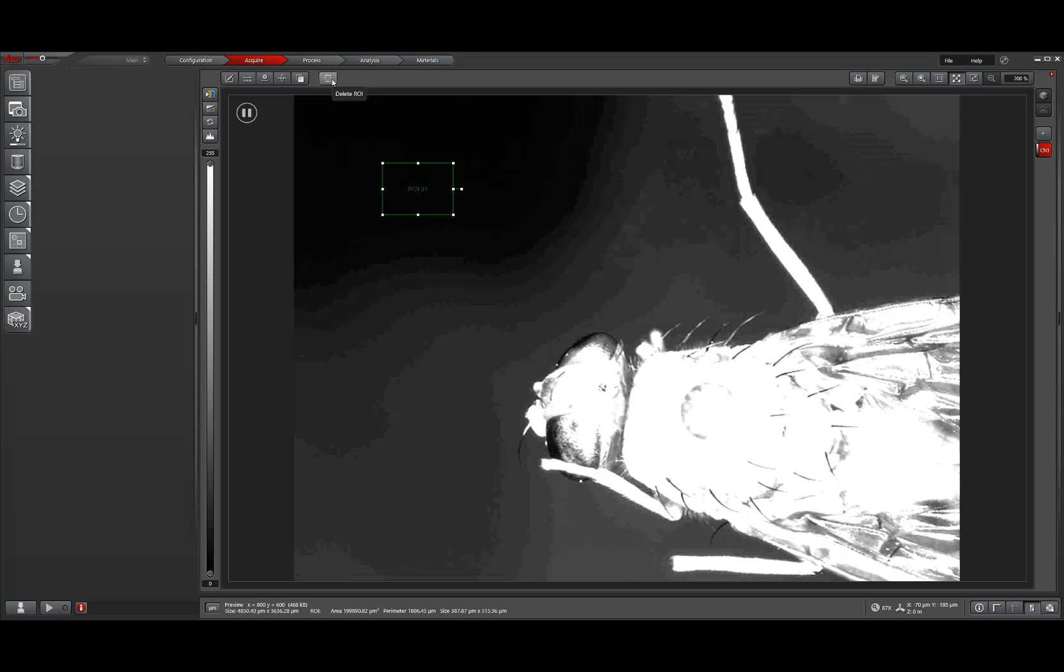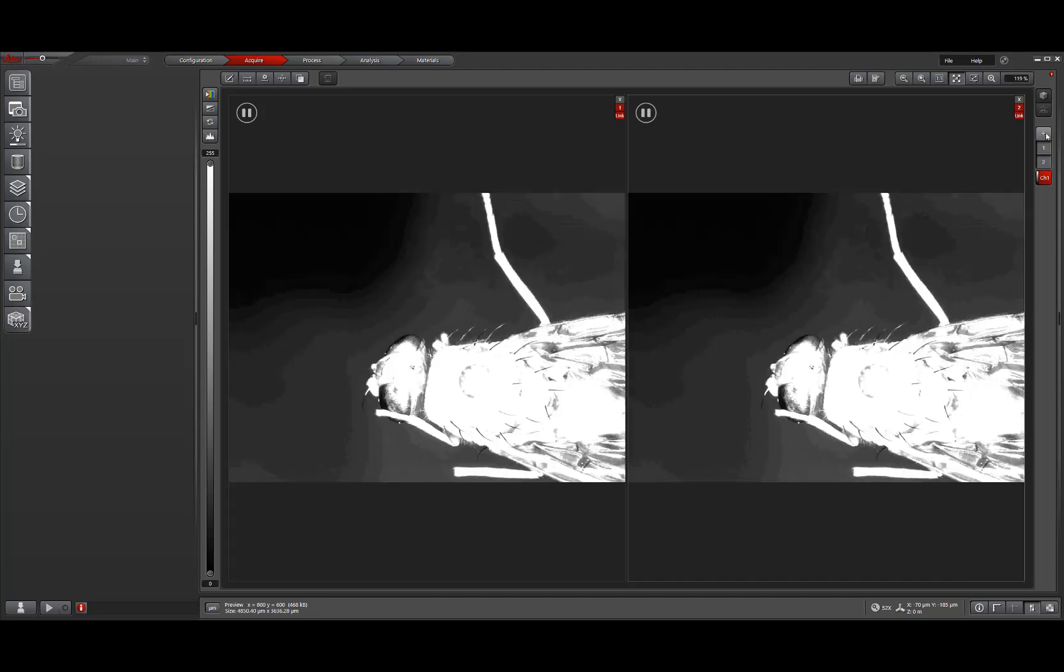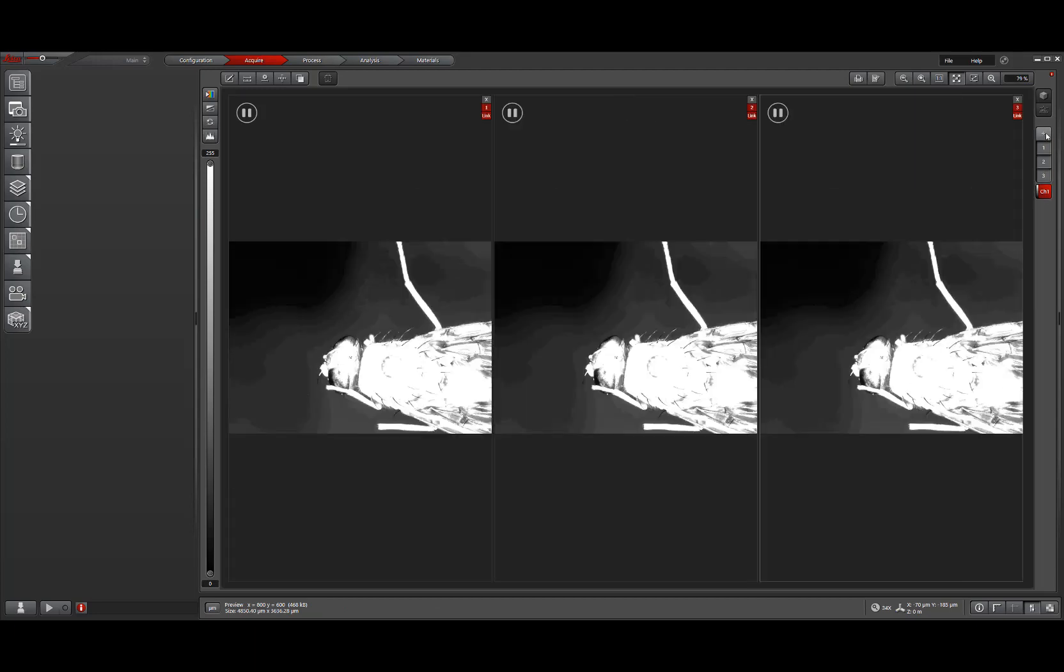The final change in behavior for LASX version 5 versus version 3 is for the picture in picture view. So here we simply just click this plus button on the right side of the screen to add additional views. They're automatically linked together, which is that chain feature from LASX version 3. And to close them, we simply just click the X in the top right corner of each view.